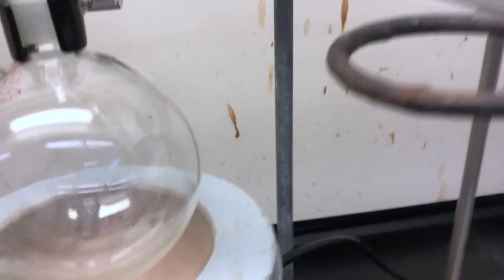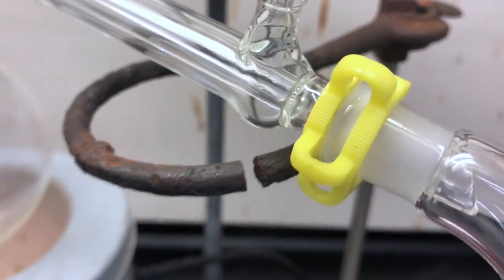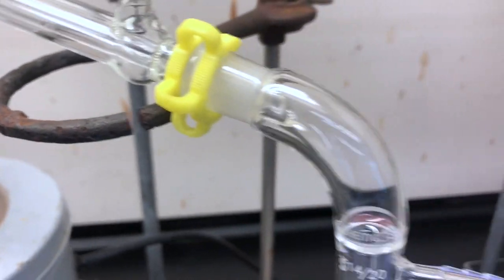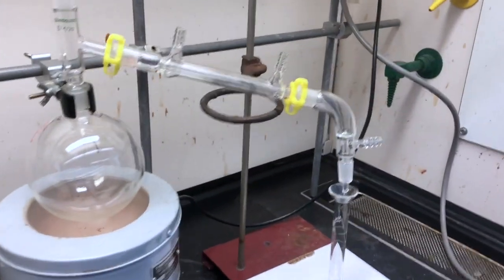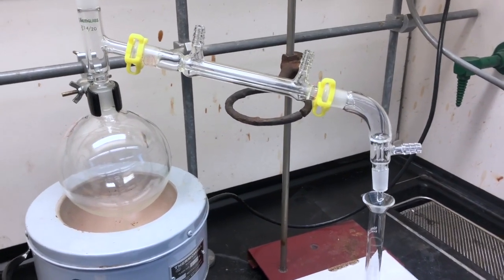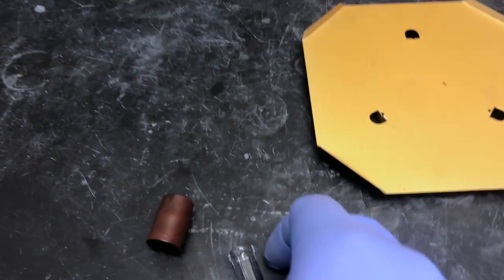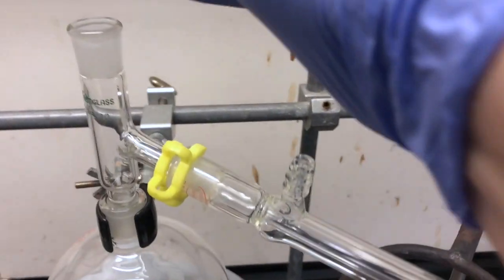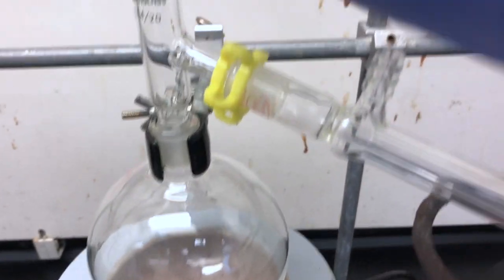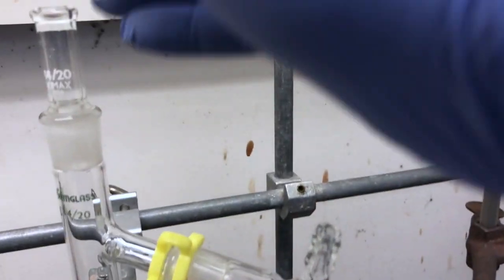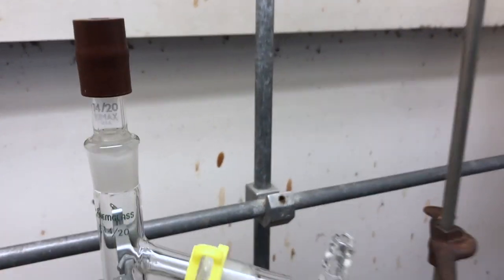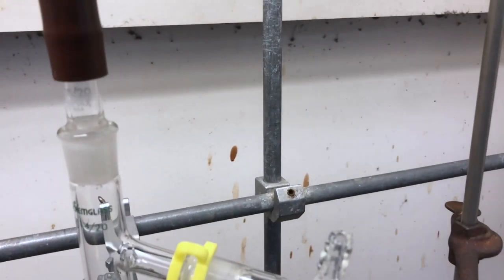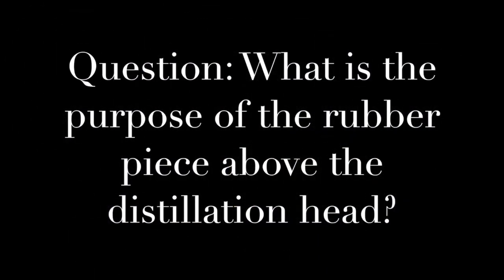In this case, it will condense the vapors and they will run downhill through the vacuum adapter into our collection device, which is a 10 milliliter graduated cylinder. We have to put on a thermometer adapter at the top so we can take the temperature during the distillation. The thermometer adapter consists of two pieces, one glass with a ground glass joint and a rubber piece. We also have clips to hold everything into place, keep it from falling apart.